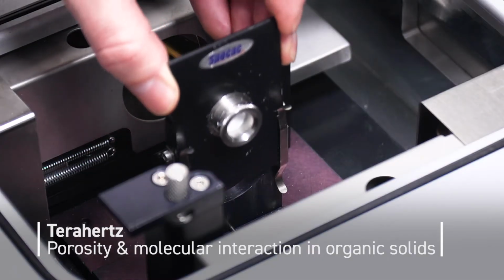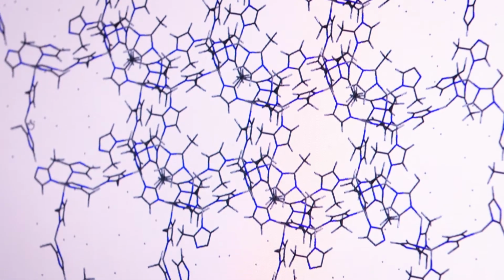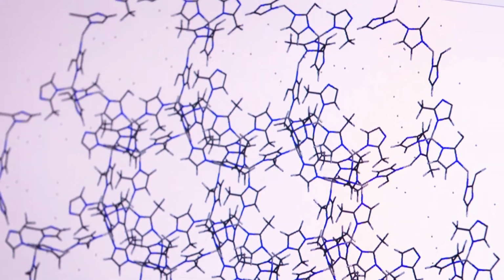In the terahertz applications group, we're exploiting spectral properties of terahertz radiation. This is a part of the spectrum that has very beneficial properties for investigating materials, in that it is able to penetrate through materials that are opaque at visible frequencies, such as polymers, ceramics, and semiconductors. So we can see the structure in these materials. At the same time, we can study molecular interaction, which happens also at terahertz energies within these materials.